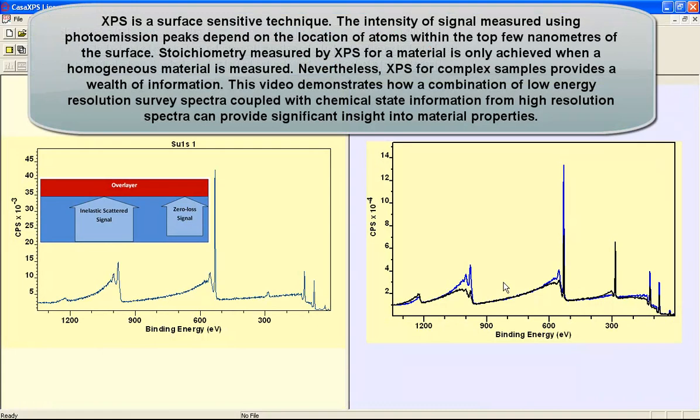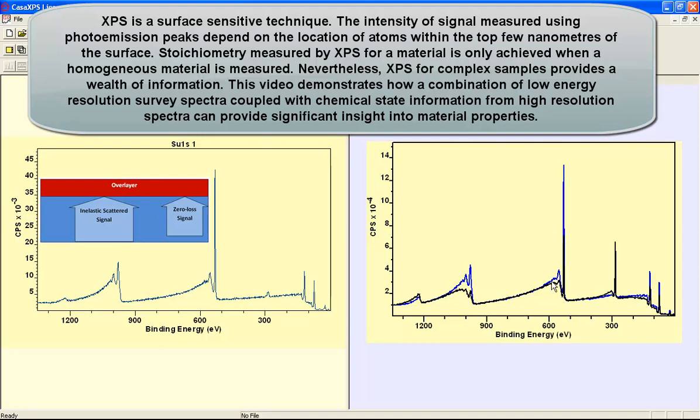In a previous video, we looked at how photo emission peaks and the relative intensity of photo emission peaks, combined with information about the background, could infer a layered structure within a material.